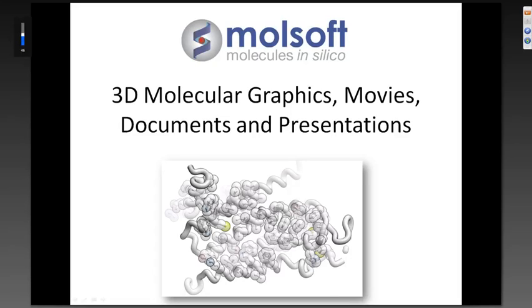Welcome to this webinar on 3D molecular graphics, movies, documents, and presentations. The majority of this demonstration will be based on our free software that you can download from our website called ICM Browser.